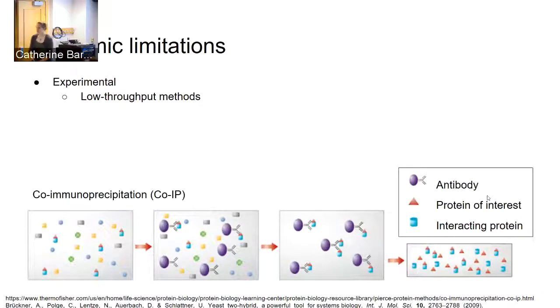Using this workflow, will you be able to detect the specific residues where the binding between proteins is? That could be inferred a little bit. But if you mean the residues that are cross-linked, yes, that we can detect for sure. But that's not necessarily a direct indication that that's exactly where binding is happening. It means they're coming within a certain distance of each other, but the actual binding could be at an adjacent surface or somewhere nearby. But then if we use your scoring, if it happens a lot more, then possibly that's the binding site.